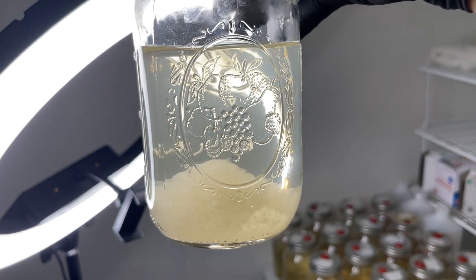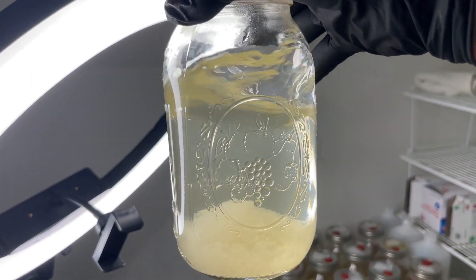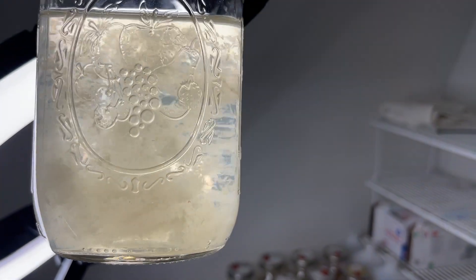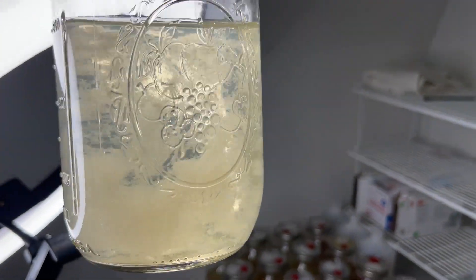The mycelium of turkey tail mushroom grows very consistent long strands of mycelium. It stays a white color throughout the whole process.